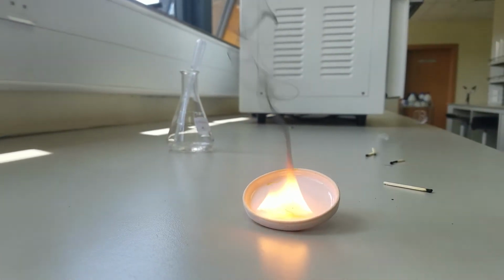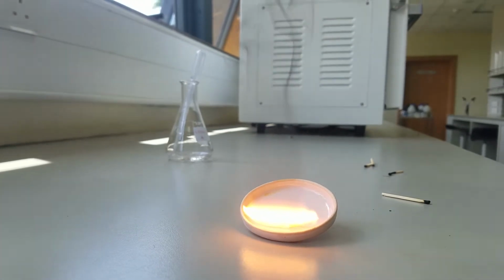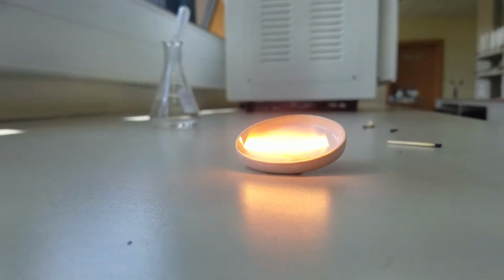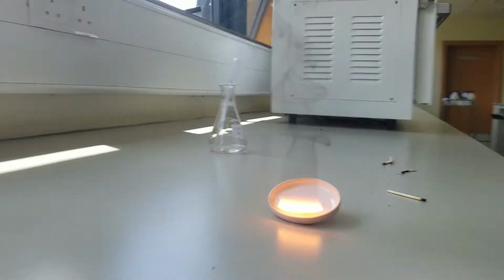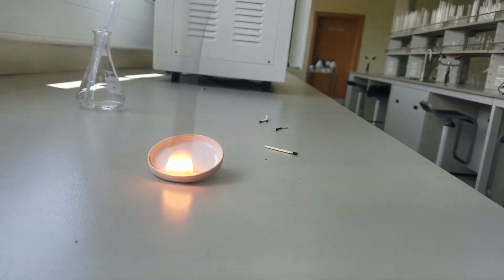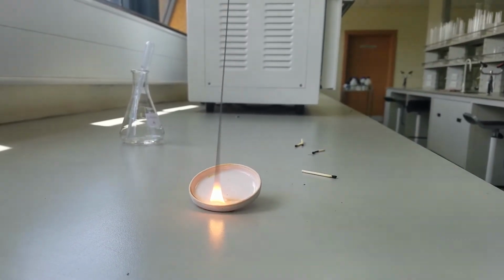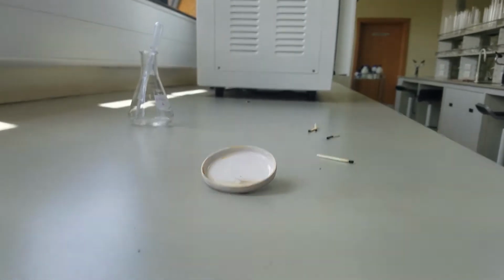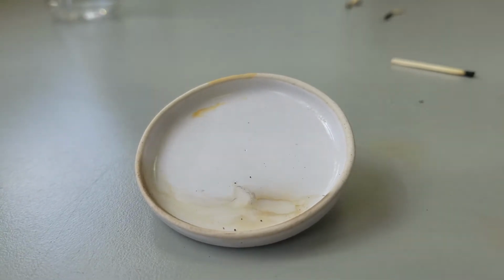Okay. Observe the soot. It relates to one of those hydrocarbons, if I'm not wrong. Good. There we go. So you can even see it.